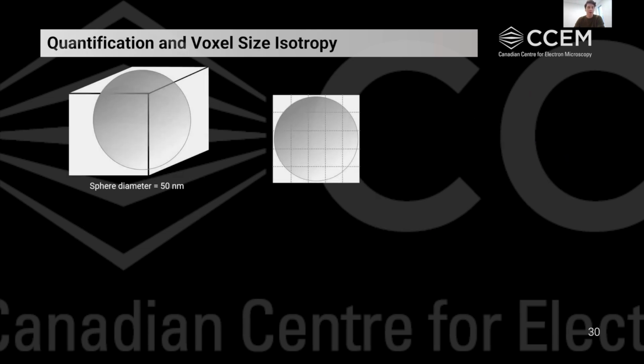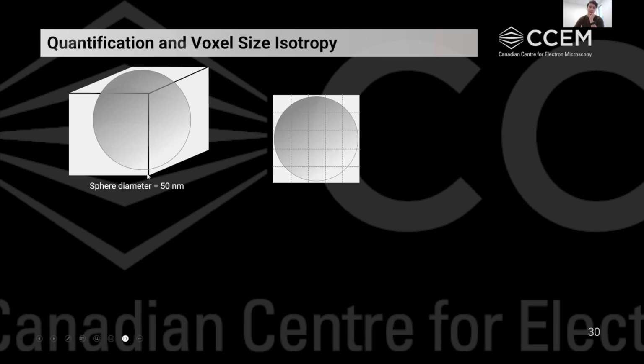Now, I've talked a little bit about how we choose our slice thickness, but I want to get into a little bit more on why that might be important. So if we look at a sphere that is contained within our imaging volume, for instance, and let's say the sphere has a diameter of about 50 nanometers.